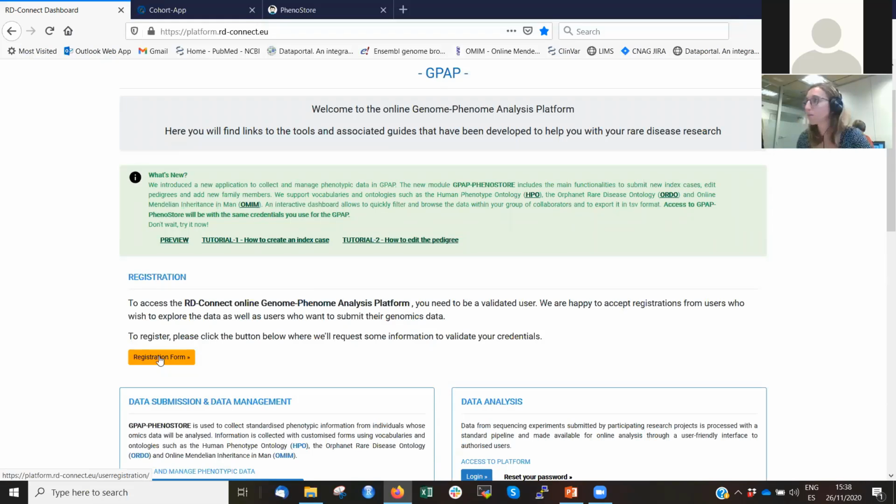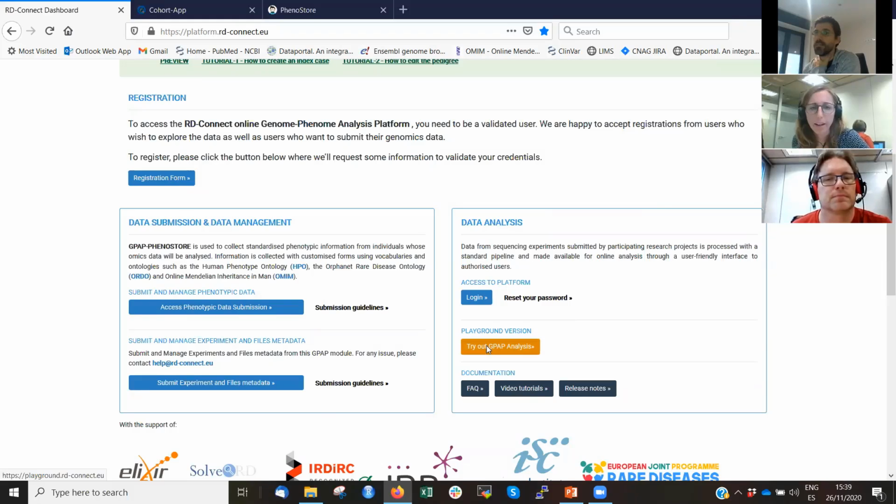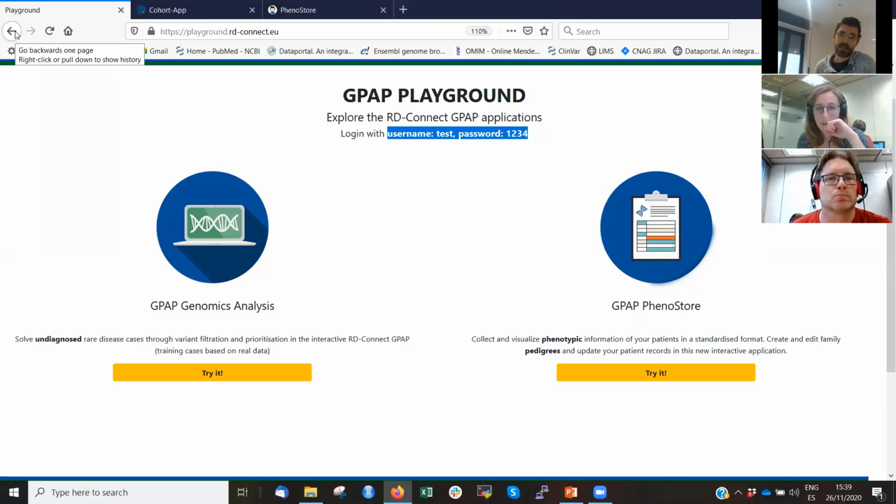However, if you want to play with Phenostore in the meantime, there is the playground that Leslie showed you here. She put it in very quickly, but I think we have it documented on the page. The username is test, and the password is 1234, and then you can see exactly what Leslie has done today, and repeat the process for yourself. Yeah, if I click here, you have information about the username and the test that Steve was mentioning. And also, to register to the platform, note that you have to be the PI or group leader of the group. So if you're, for instance, a PhD and you want to access the platform, you should ask your PI, and he can apply on the homepage in this user registration site. He can apply to register to the GPAP.